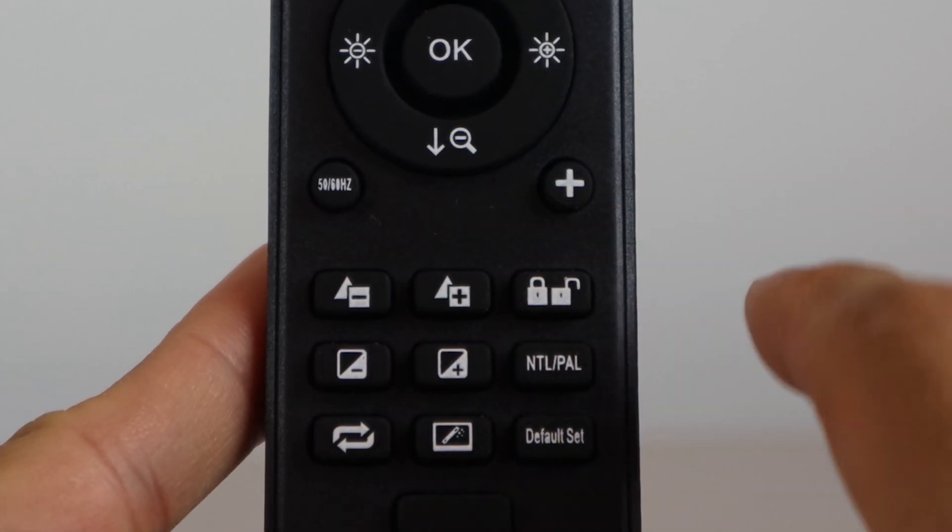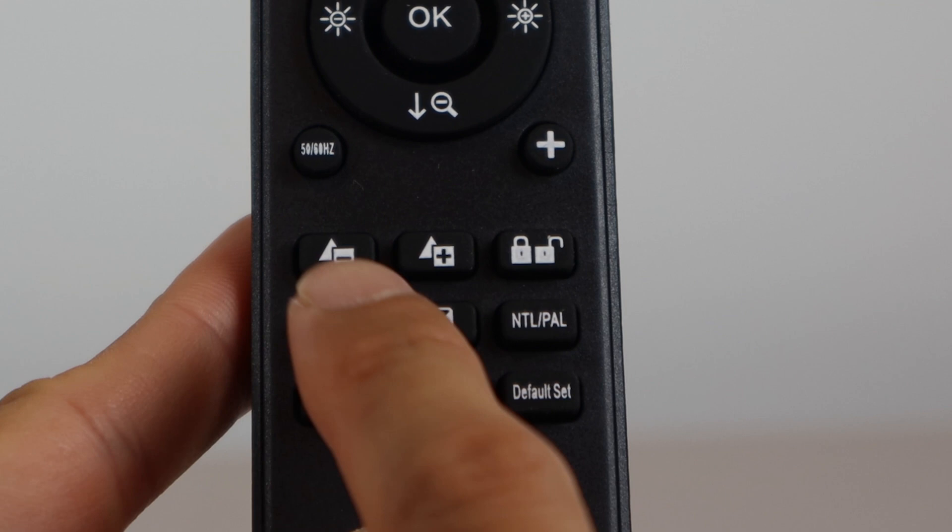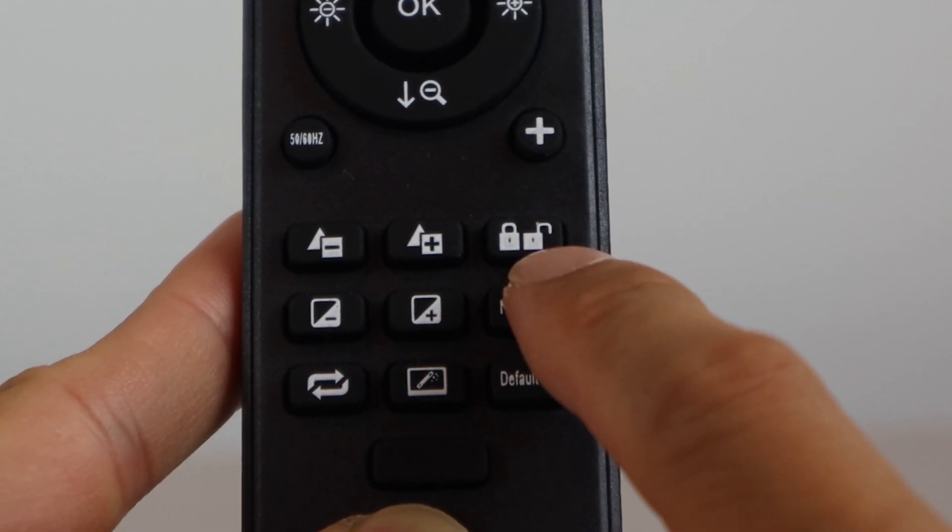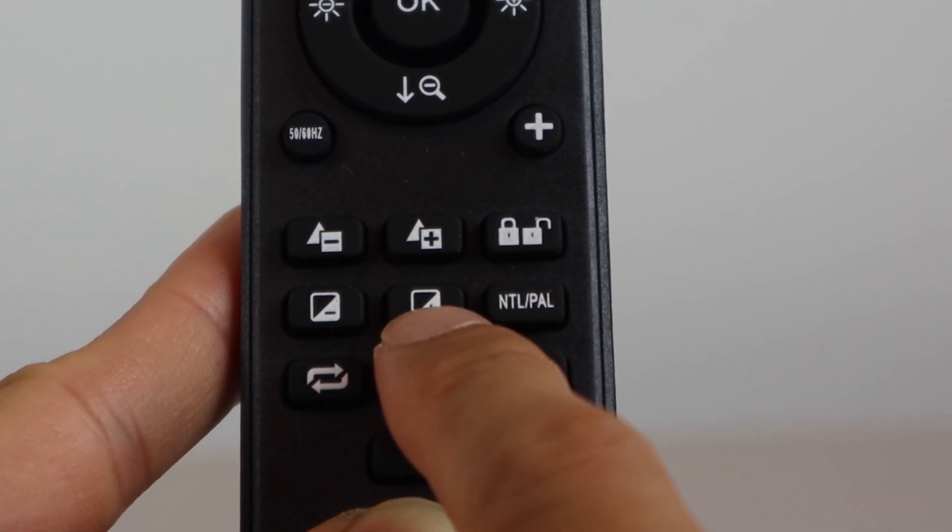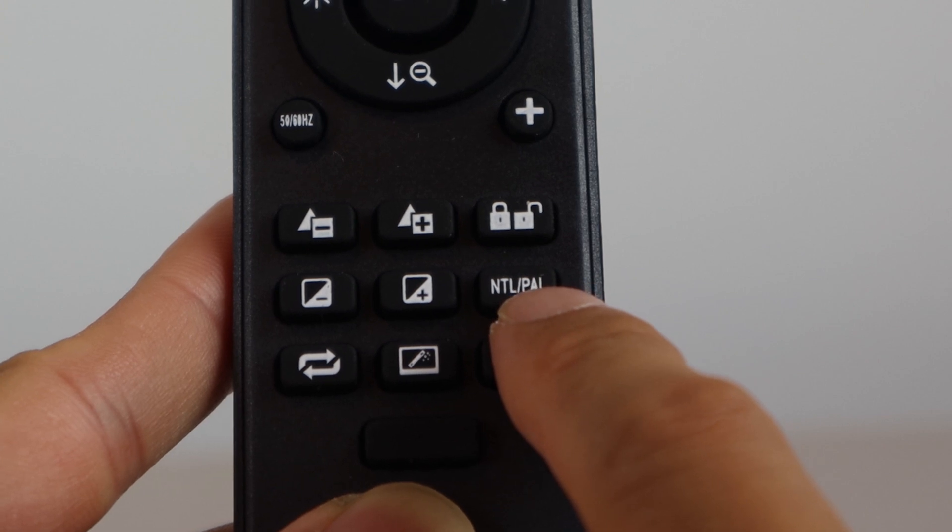It also has frequency selector, display gridlines, sharpness adjustment, lock and unlock, LCD brightness adjustment, and NTSC or PAL selector.